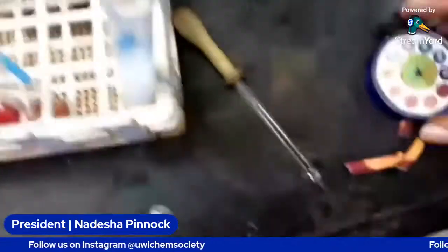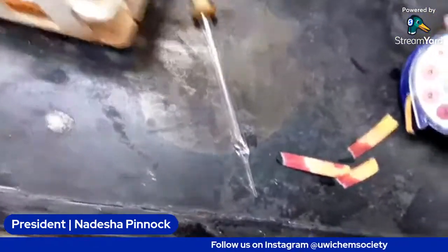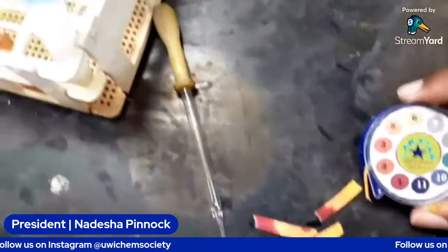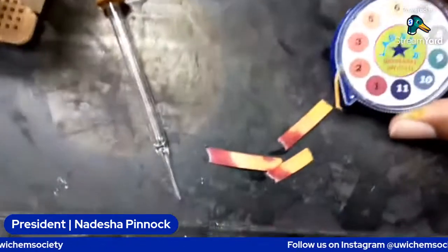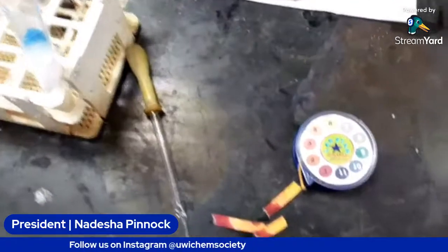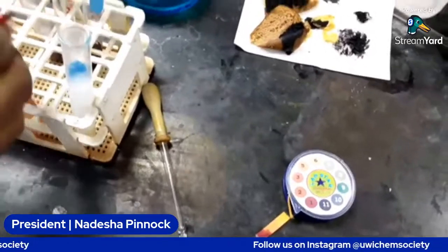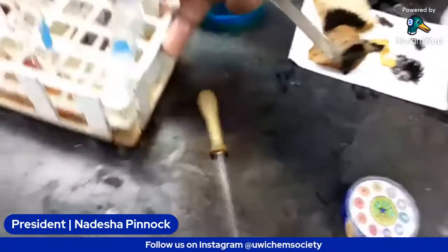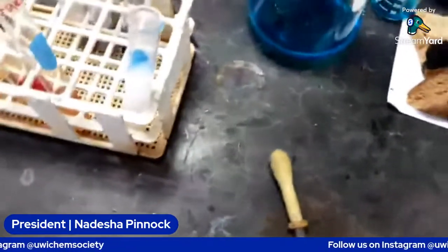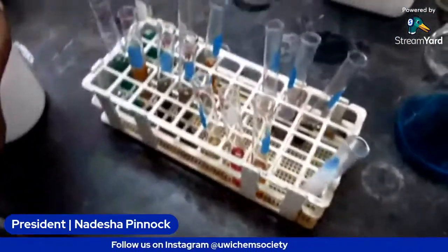Based on this, the pH here is about 1. We just added HCl to it, and the HCl was about equal in quantity to the sample we had. So it's highly acidic, and we're going to have to add a good amount of sodium carbonate to neutralize the acid, and then we're going to test the pH again. Once it's slightly alkaline, then we're going to add it to the water bath with the Benedict's. So we're going to add the sodium carbonate.